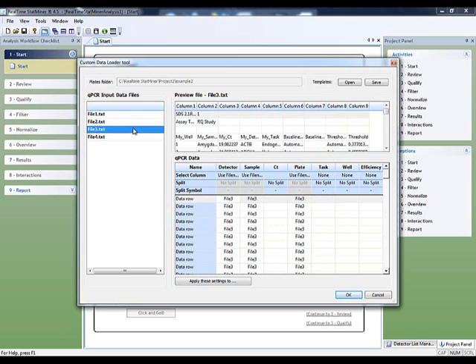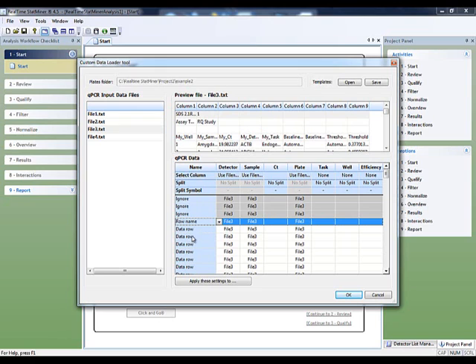We are not as lucky with the next file. As we can see, all the information which is useful to us has custom identifiers unrecognized by this application. Because of that, StatMiner Reader is unable to determine where the data block starts. We can fix it by selecting from the left combo the row where the input data starts. As we can see, all entries above are now automatically ignored, and we define one by one every category.